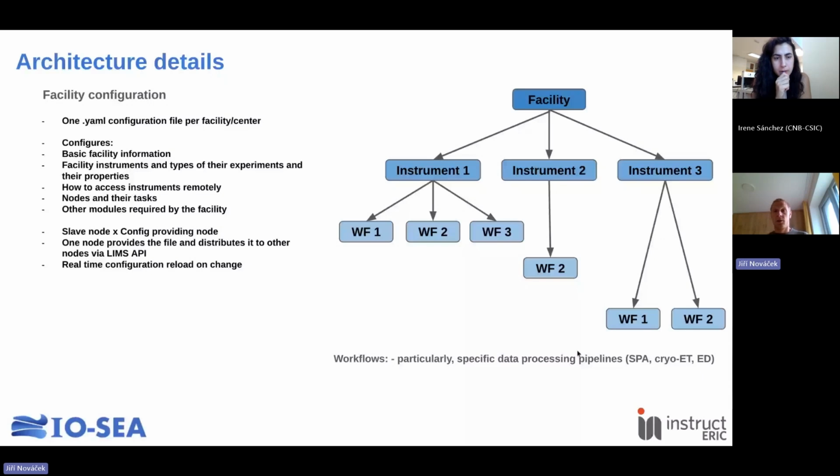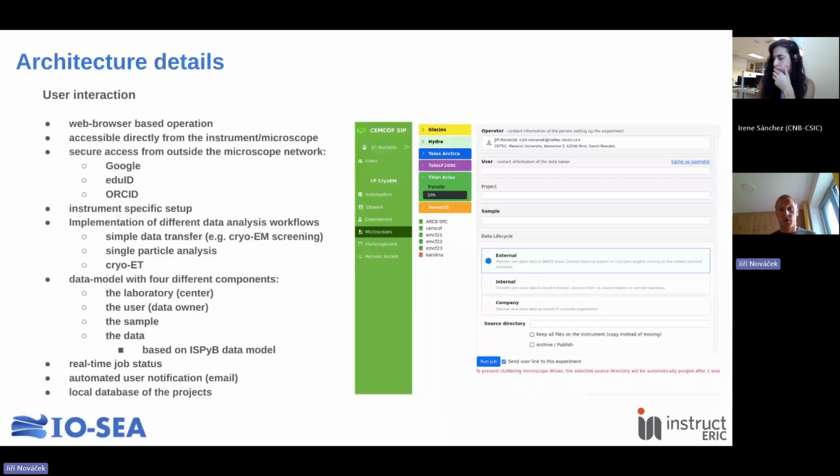One can easily imagine that this could be just the data transfer. That is the simplest workflow, and that can be implemented for any type of solution and facility. And this is how the front-end application looks. It is web browser based, which means that the user does not need to install any additional software. It is accessible directly from the microscope, and it is actually the single point to transfer the data from the microscope to the user.